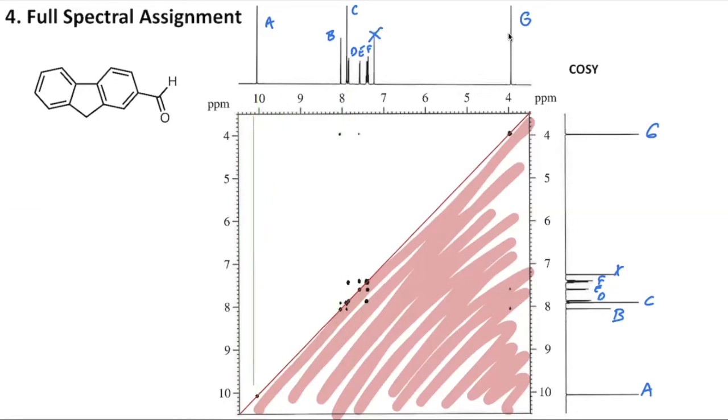There's nothing else that we need to worry about there. So I'm just going to slowly move it over until we get to here, where it looks to me like we have a peak right about here and one that's very close to the identity diagonal right about there. So there's two that kind of fall underneath there, and we'll talk about what their correlations are in a moment.